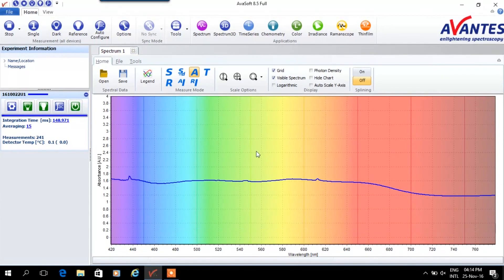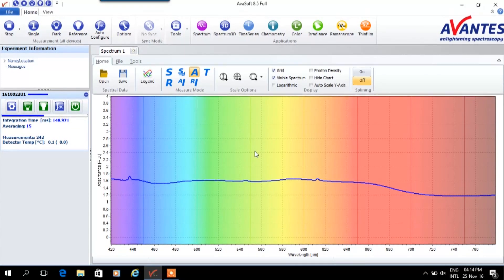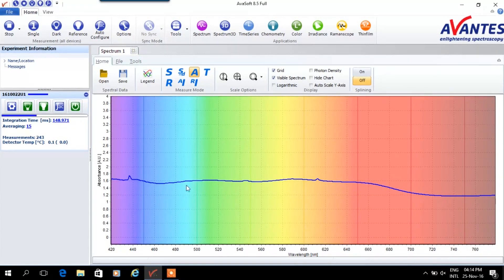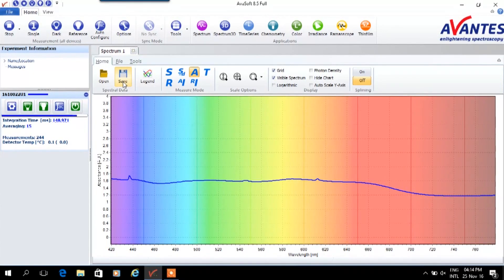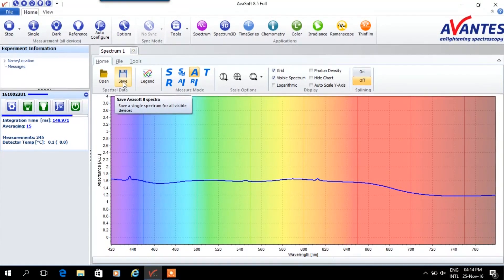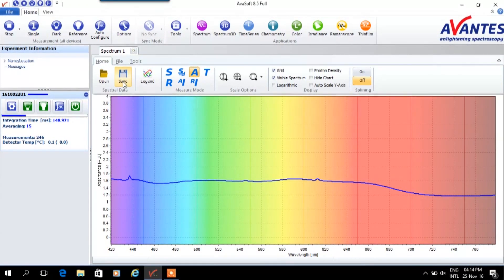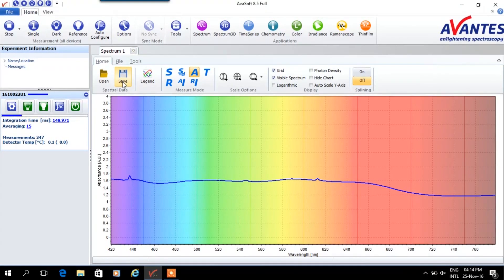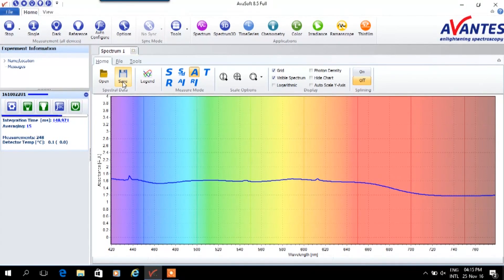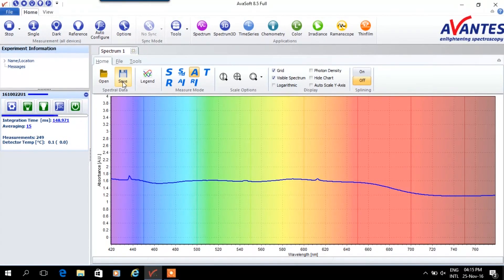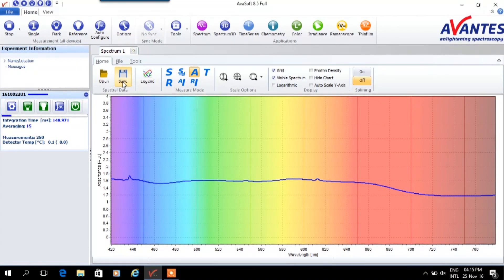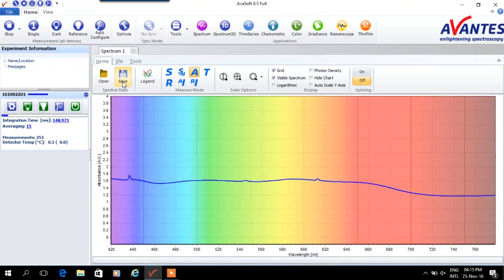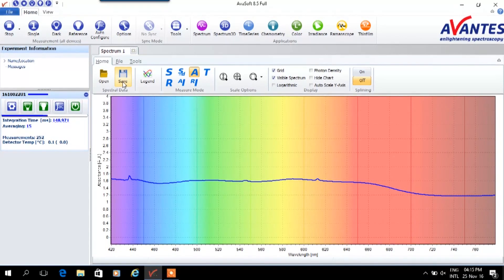Place the sample in the light path and do a measurement. The absorbance spectra are now visualized. Files can of course be saved and exported for offline analysis. Measuring a high absorbance value demonstrates the excellent dynamic range of the ArvaSpec Hero — with a more standard spectrometer, noise would negatively influence the measurement results.